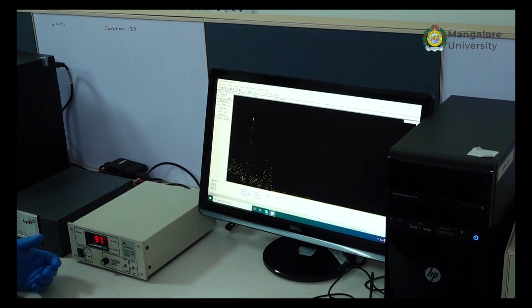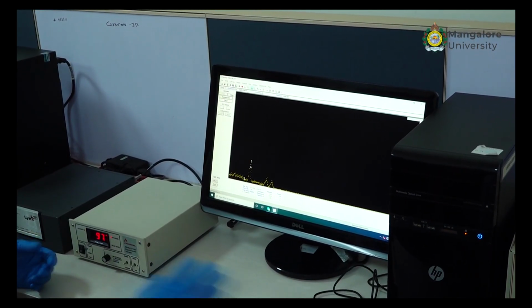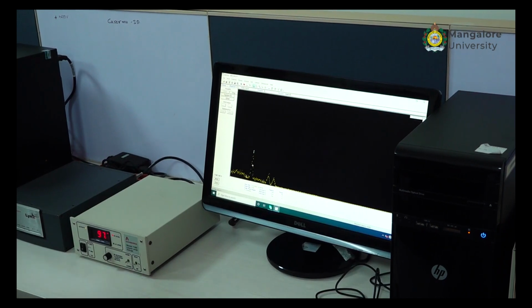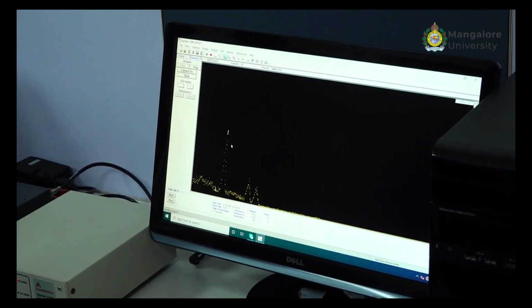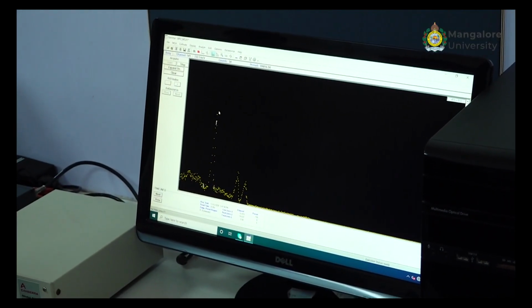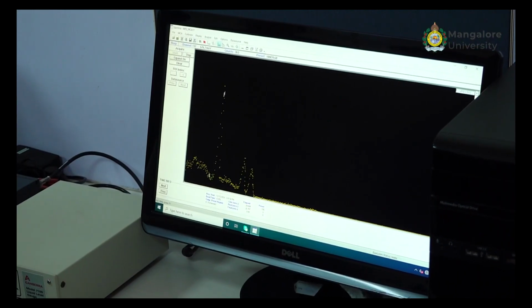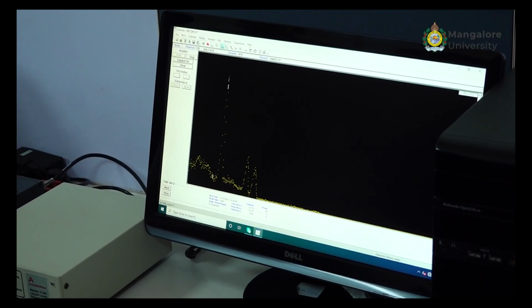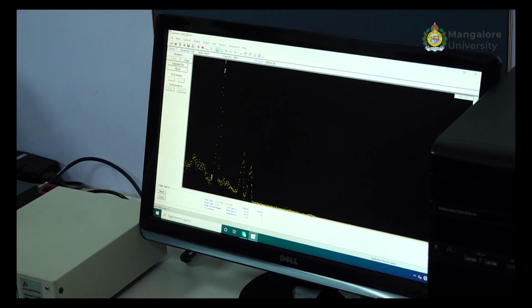See. So that is okay. You have seen how narrow the channels for cesium were already, right? So you can see that here, this is 661, correct? Yeah, 661. So it is cesium. Can you see the channels over here?